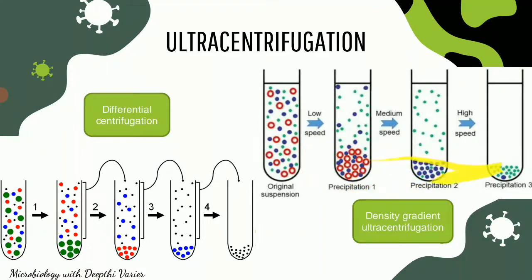As we are passing them through, the solution is going to separate the sample into layers by relative density. So every time we are centrifuging, the molecules are settling down under the centrifugal force till they reach the density which is the same as that of the medium. Till then, they'll keep settling down. Once the medium's density and the particle's density are the same, they'll stop settling down.